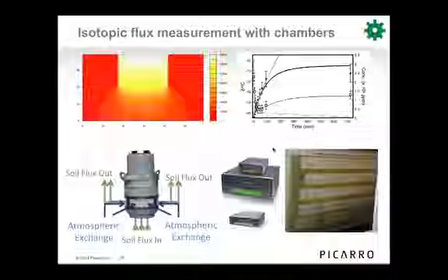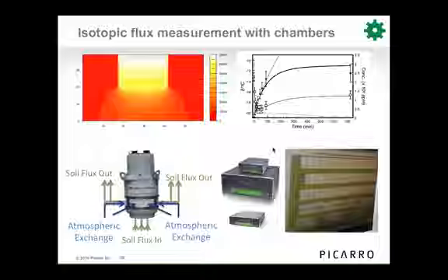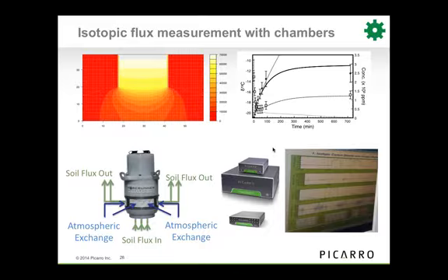What we've done is we plumbed this directly into the Picarro analyzer using their 16-port manifold, so you can have up to 8 chambers per analyzer, and the small sample isotope module, which allows us to draw small discrete samples from the chamber for analysis.